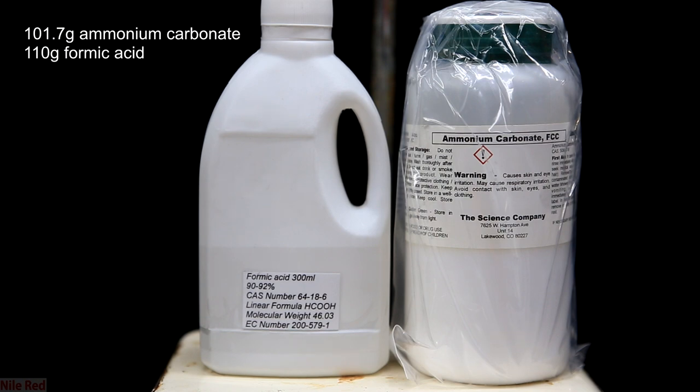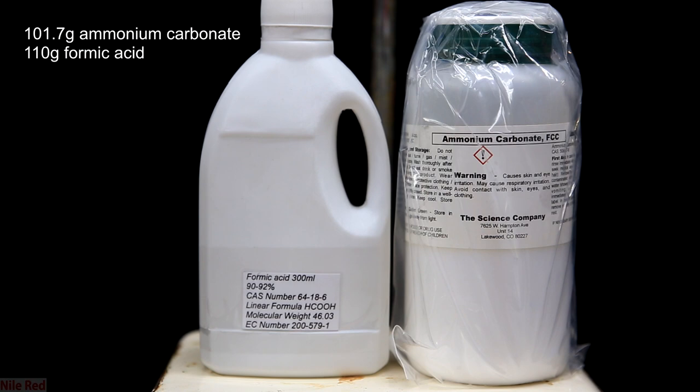Formic acid is actually used by beekeepers to get rid of mites, so it's not very hard to obtain. I bought my formic acid off eBay and I bought my ammonium carbonate from the science company. The ammonium carbonate could just as easily be purchased from eBay though.